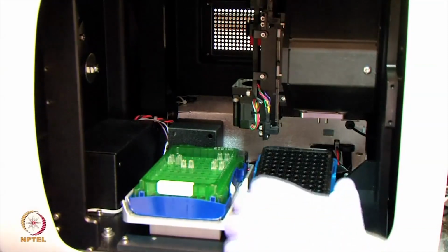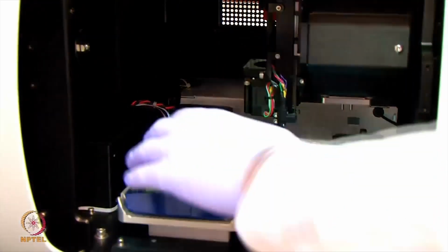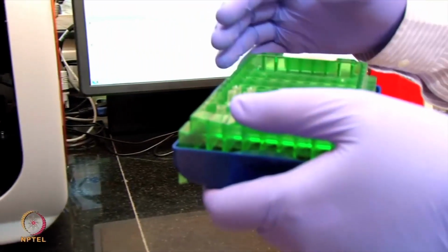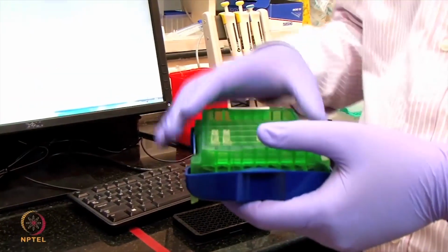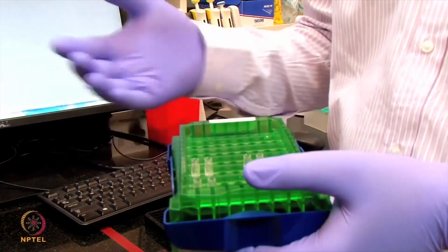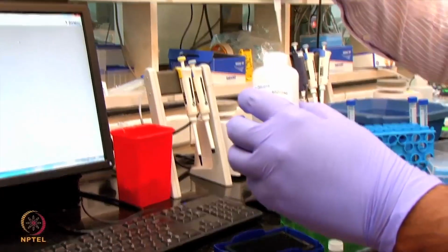Now I am going to take back this sample plate and also the sensor tray. This sensor is hydrated in the PBS buffer, and our biotinylated antibody is also in the PBS buffer. Now I am going to equilibrate these sensors with the PBST buffer, the PBS buffer having Tween in it. We call it the sample diluent buffer.